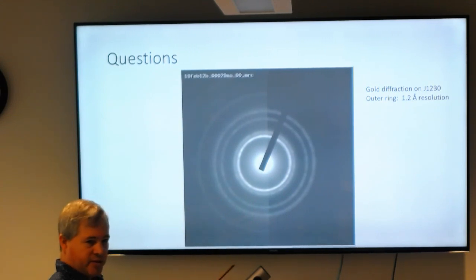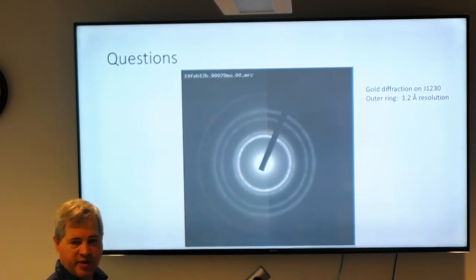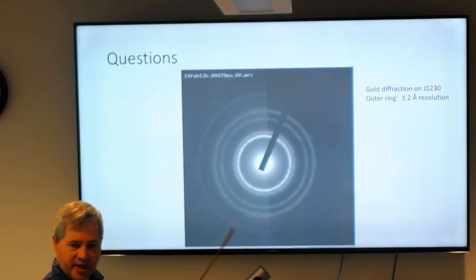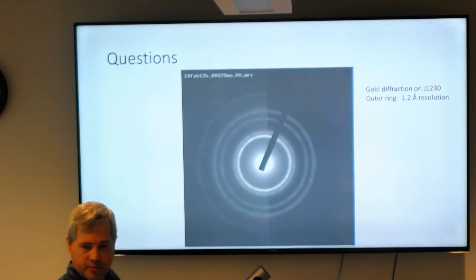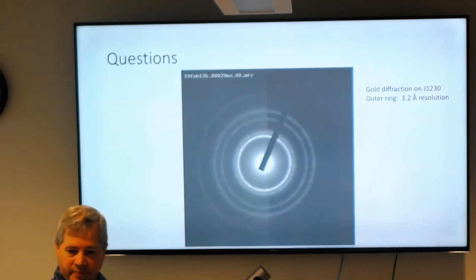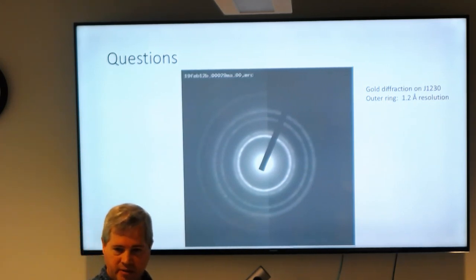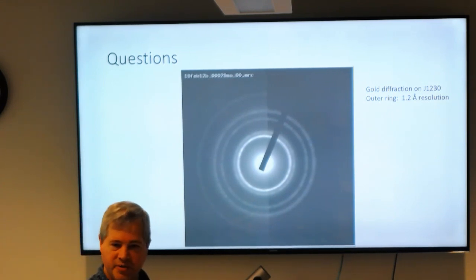And the environment matters a lot less, because you're collecting diffraction, it becomes insensitive to vibration or sample movement, because you're just getting the intensities. Any sort of vibration or sample movement would show up in the phases, but you're not collecting the phases. So it actually becomes much easier to collect on a much lower end microscope. So yeah, that's the MicroED technique. Especially for organic chemists, I think they're quite interested in it.